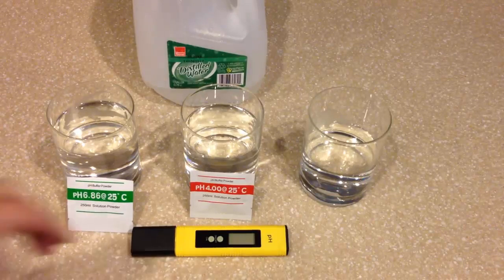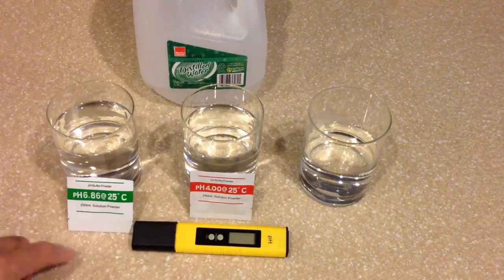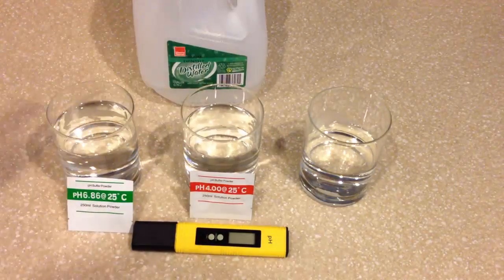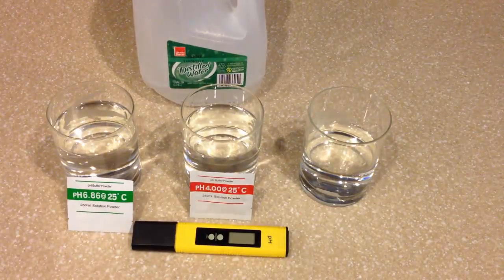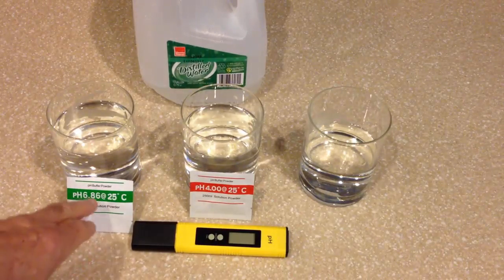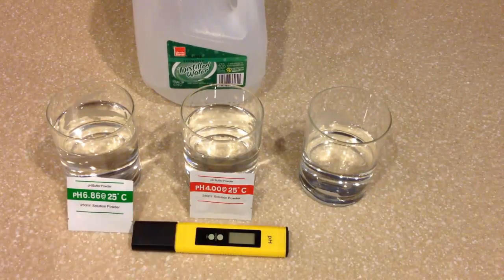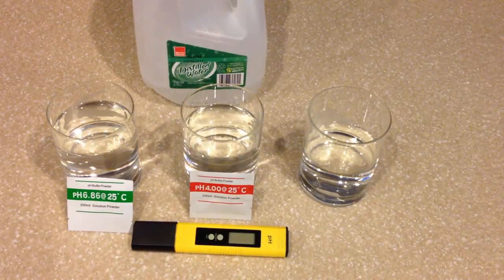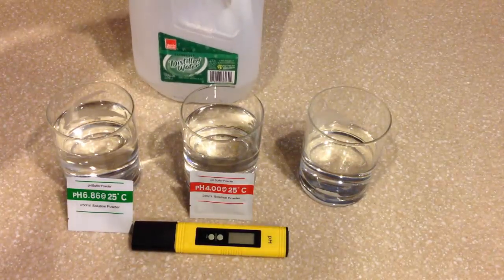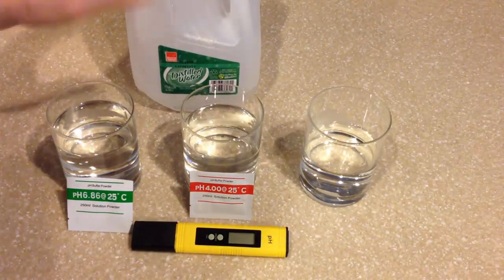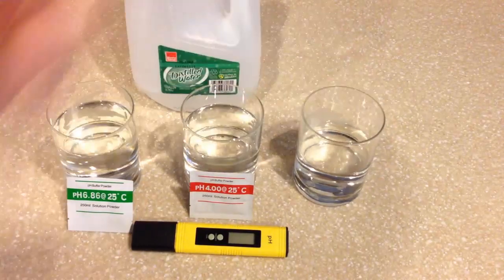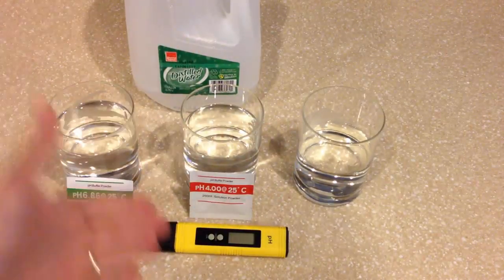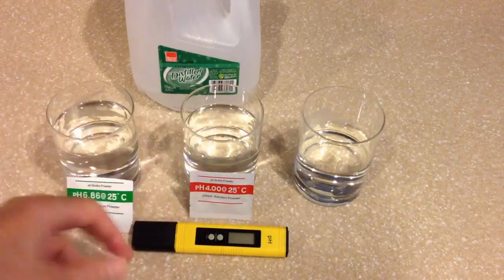As you can see in front of you, I have the meter itself, and then I have the two calibration powders that I've mixed into these two glasses. Each glass contains its respective powder, the 6.86 and the 4.0 calibration solution, mixed in 250 milliliters of distilled water, which is what this gallon jug is back here. This glass is simply filled with distilled water, so I can clean the probe between inserting the probe into each one of these respectively.